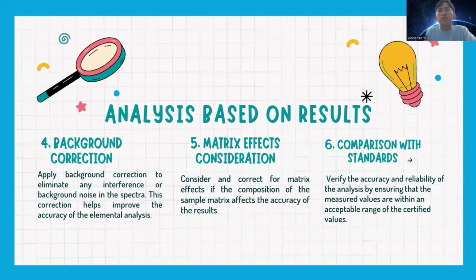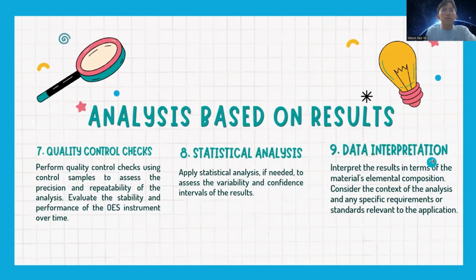We need to verify the accuracy and reliability of the analysis by ensuring that the measured values are within an acceptable range of the certified values. The seventh step is the quality control checks.